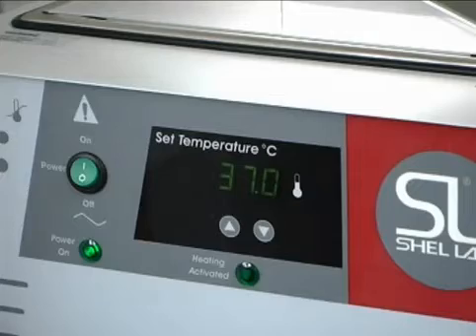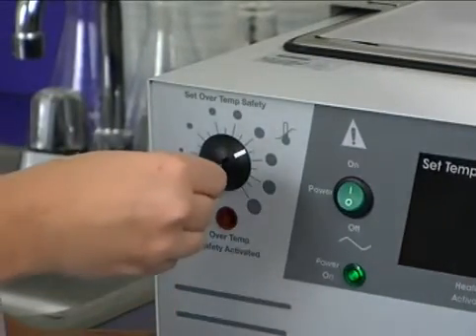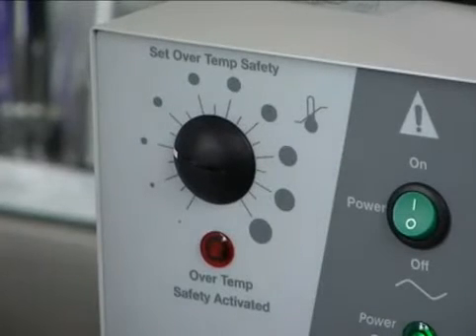Each Shell Lab water bath is equipped with a safety thermostat to prevent the bath from overheating. To set the safety, turn the thermostat counter-clockwise using a flathead screwdriver or a coin until the over-temp safety activated light begins flashing.